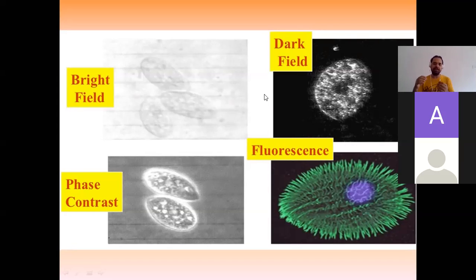It will not take so much time, but a fraction of time, and the image will slowly develop. So the idea is capturing the light, emitting the light, and between that, the process of fluorescence will happen, and that is being recorded in the microscope.